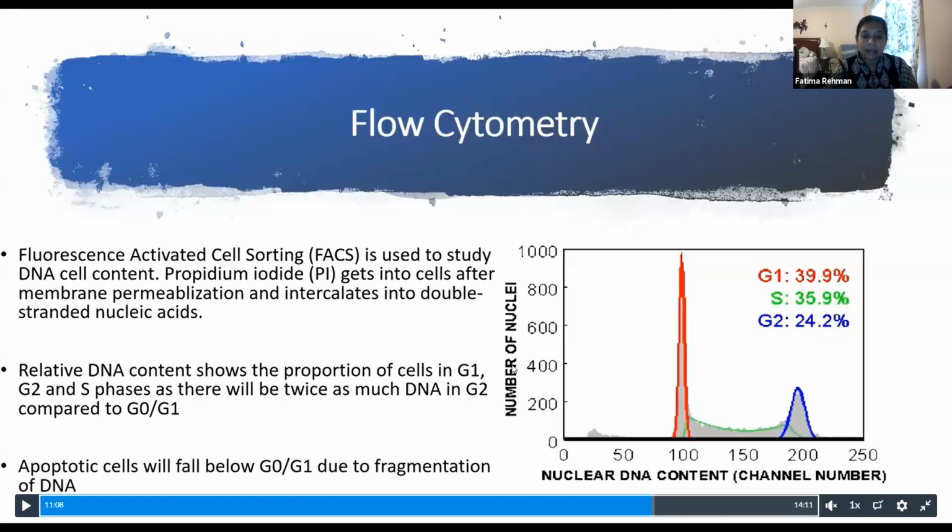So what it is saying is that these cells that are living, that are on your plate, what exactly is happening to them? Are they in quiescent or G1 state? Are they in synthesis phase? Are they in G2M phase? So where exactly do they stand in the cell cycle?